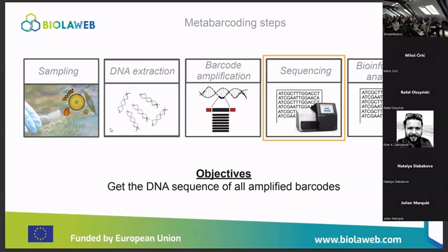So Julian online asked, does the silicate wall of diatoms pose a problem during the DNA extraction step? It is a very interesting question, and it is, in fact, but maybe, Frederic, you're going to speak a little bit more. But yes, it's a very, very good question. And indeed, I don't know precisely how you get rid of the diatom silicate structure.